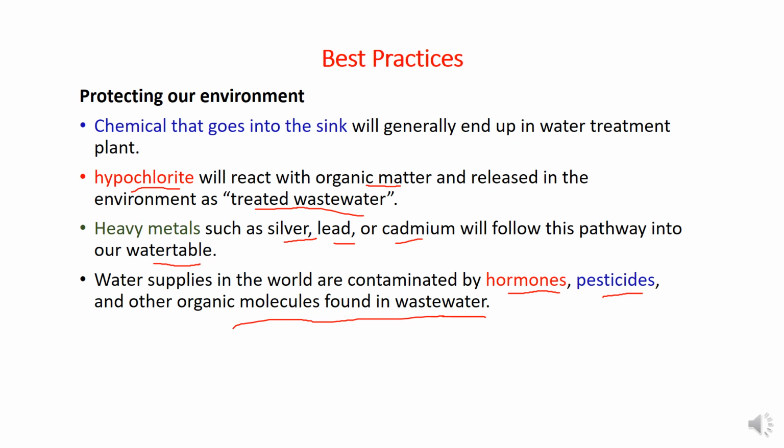Always dispose of it properly. Although this looks very easy, we observe that sometimes some students throw even the cultures, and that is also waste because it contains certain bacteria. Once it goes into the soil, it leaches down, or it can become part of our fresh water. Once it's pumped out, it can cause different diseases like diarrhea, etc.